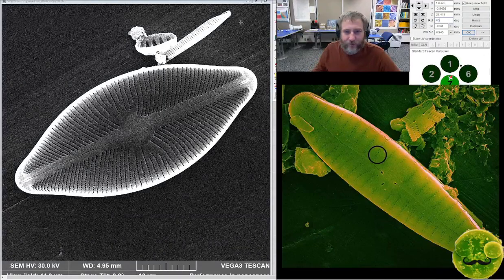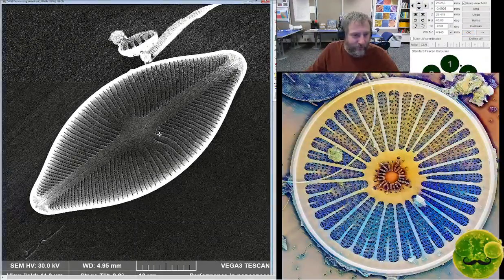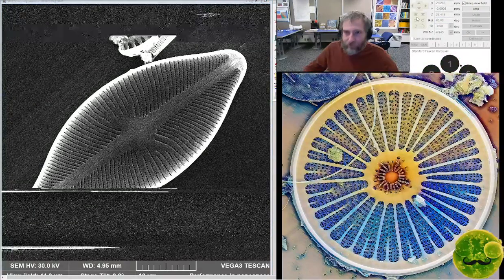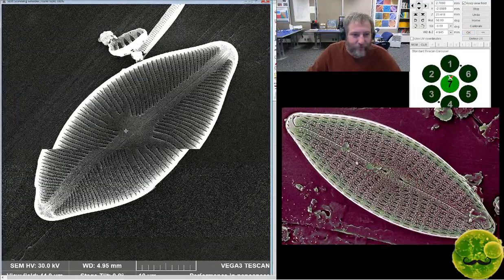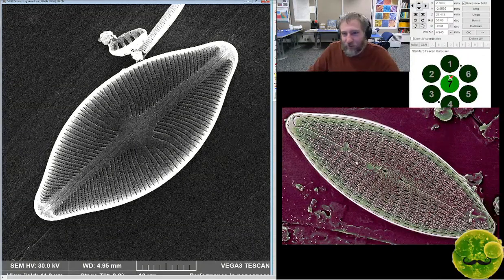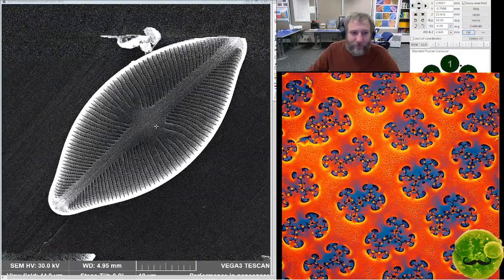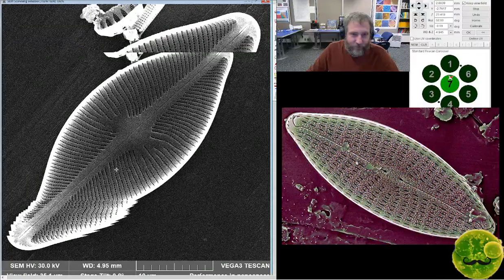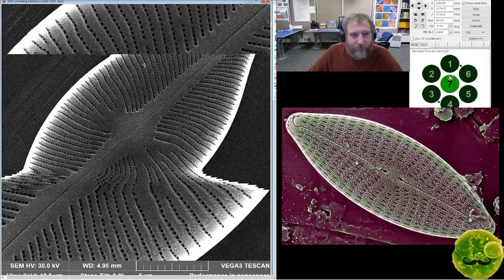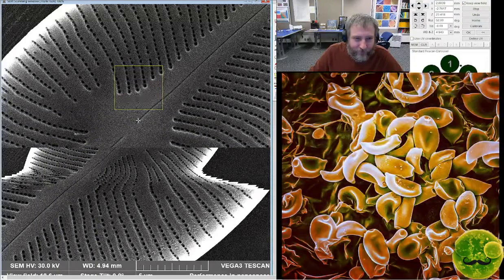All right, let's try to rotate this. Increasingly, since we got the scanning electron microscope, I've been more of a taxonomist, but I'm known more as a paleoecologist. But you can't really just do one thing and be a diatomist, because there's potentially a million diatom species that aren't described, and so no matter what you do, you kind of have to be a bit of a taxonomist. There's not really a choice, because you have to get good at doing all parts of the job, unless you just got friends who are taxonomists that want to help you, which I do, but even then I still need to do a bunch of it on my own.